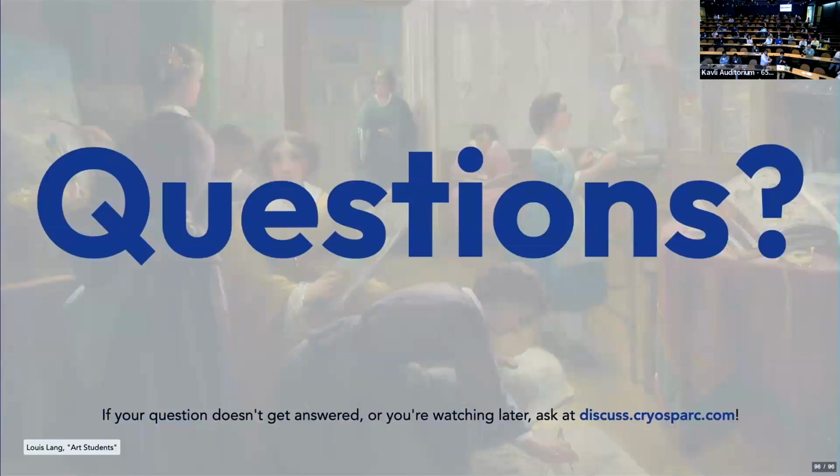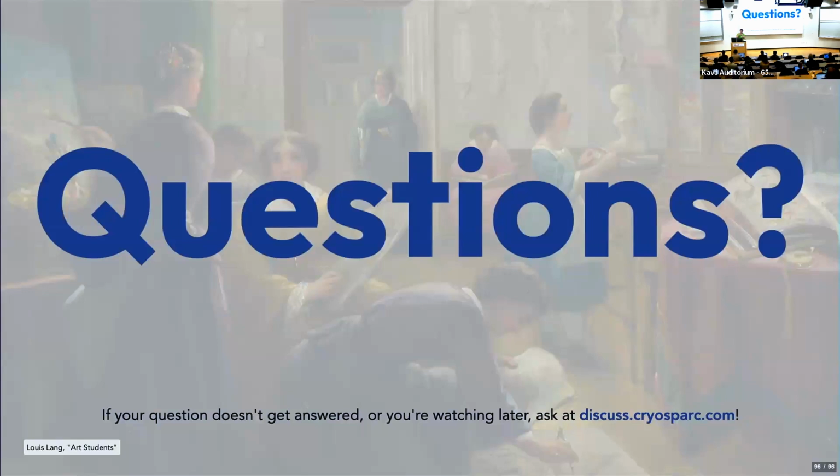Yeah, I think that's a really important point that I was going to make as well. It's tempting, if you have a map that's almost there and looks symmetric, to impose symmetry, and then you're off to the races, right? My recommendation is to wait as long as you can to impose symmetry. If you think about the alignment steps, your C4 symmetric map, even if the particles are not C4 symmetric, if the map is identical in all 4 of the poses, no one of those will be better than any other. So it'll be harder to break that asymmetry. That's what I was saying about, do you have to go back to C1?